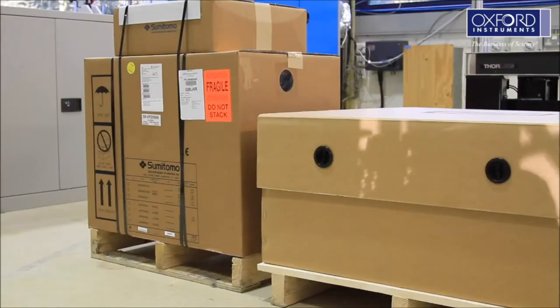If you are unpacking the system yourself, we recommend moving the pallets as close as possible to the location where you will use your Optistat Drive.